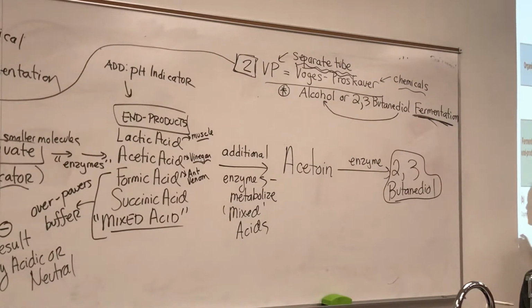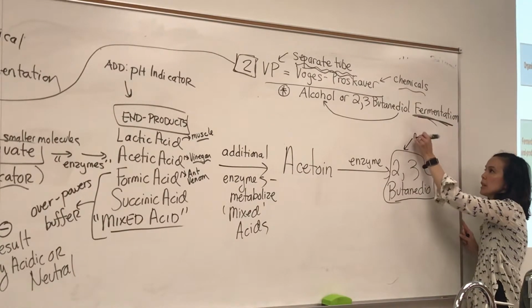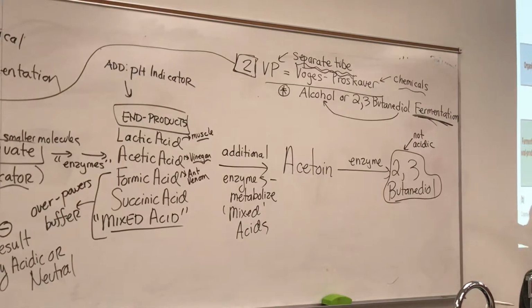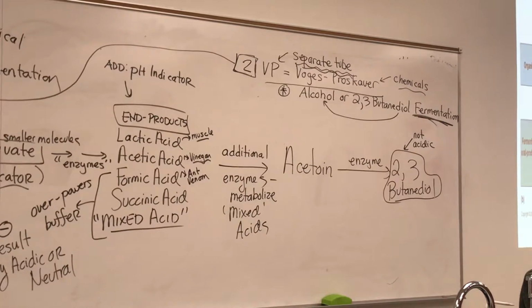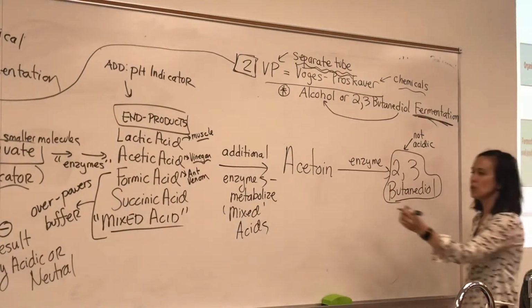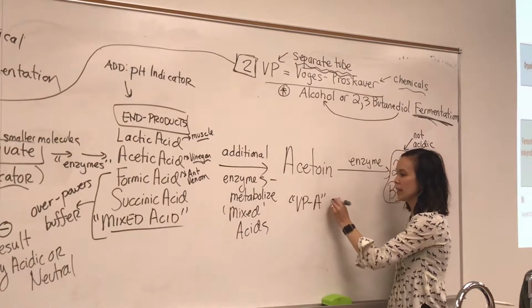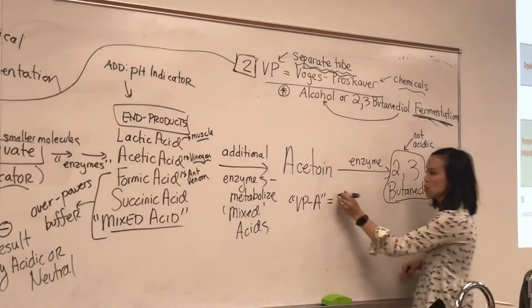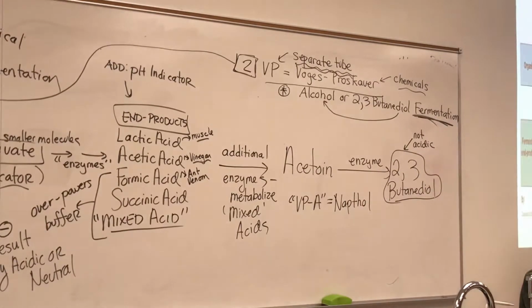So then the only difference is now the alcohol is definitely not acidic. So we can't rely on the same methyl red chemical, if that makes sense. The methyl red is not going to help us out with the alcohol, so we have to use different chemicals. So you're going to sprinkle in an A again, and a B, just like last time. The A is a chemical called naphthol, and I think this is the only confusing part.